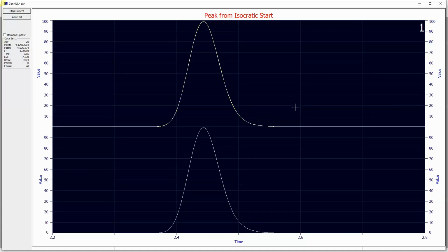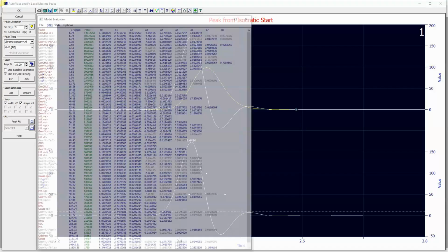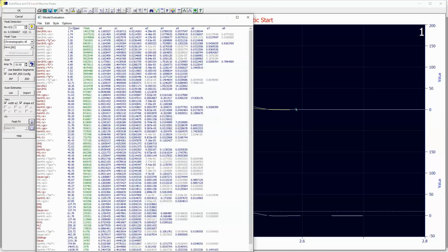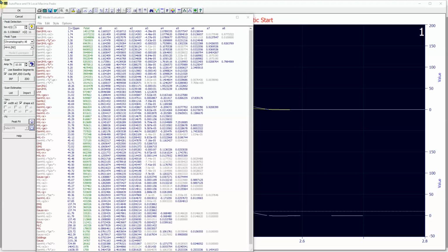One after another in sequence, the different peak models are fitted using reasonable starting estimates for the different parameters in each of the models. Unless the starting estimates are well removed from those appropriate to the data, or the model is itself not capable of fitting the specific shape of the peak, the fits will be very fast, as you see here. This option tests not only the core models, but the collection of built-in IRF or instrument response functions. In a short time, you will have a good sense for which of the many peak models in the program fare especially well in fitting this specific peak data.